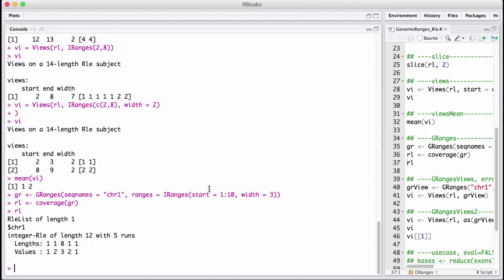When we have a genomic range like this, or an RLE list like this, we can instantiate, we can again instantiate a view on it. And now we give it a... Yeah, let's view it on the G ranges we had before.